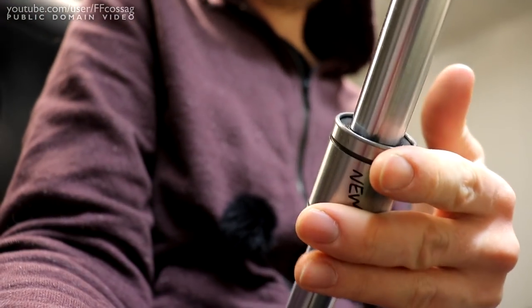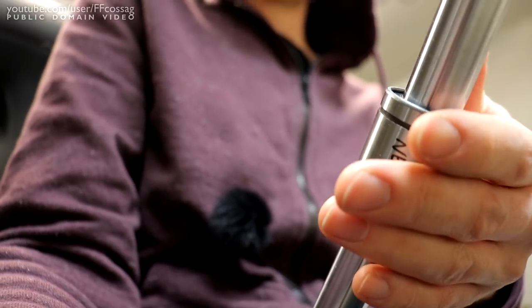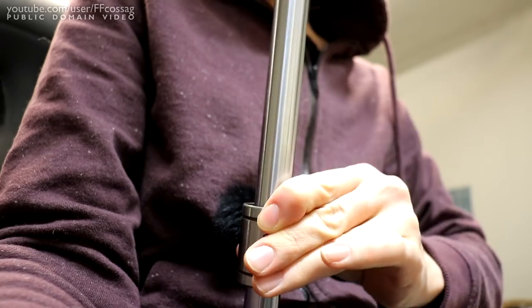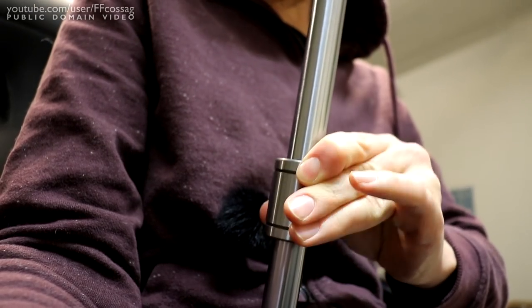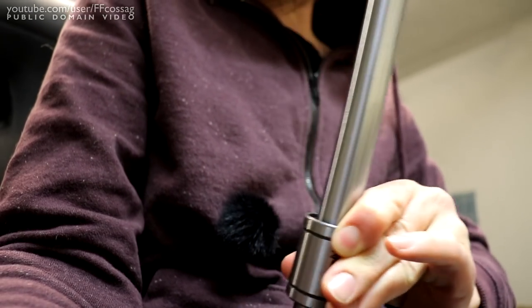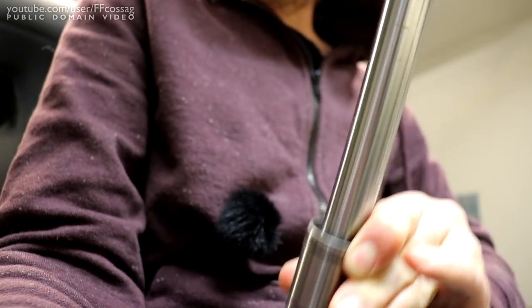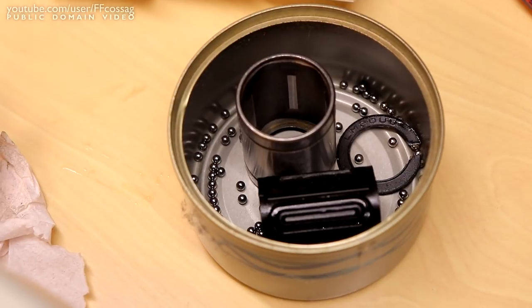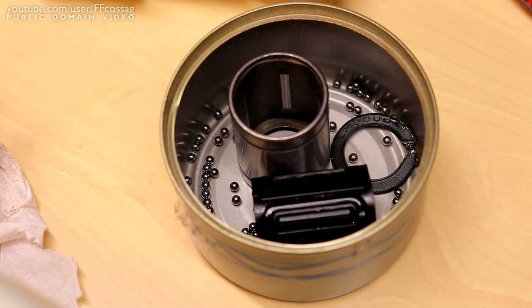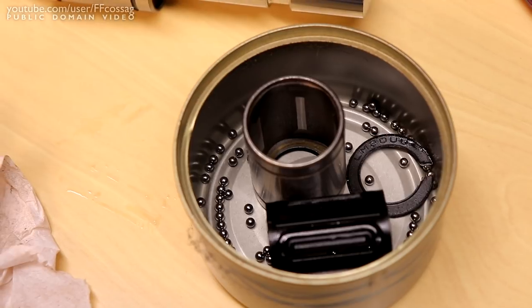Now listen to the sound of this brand new bearing sliding on this brand new rod.